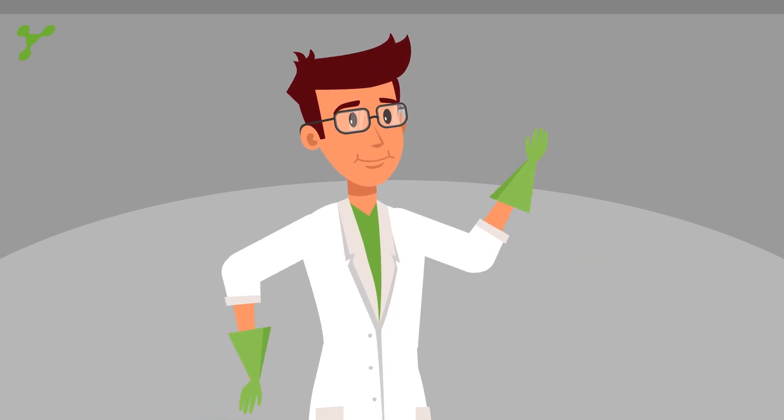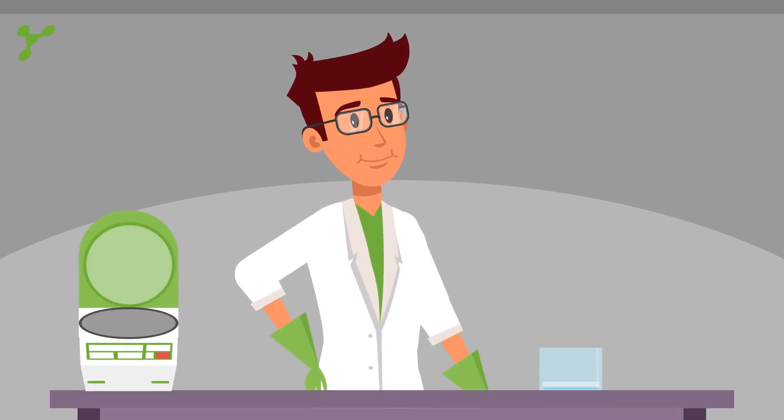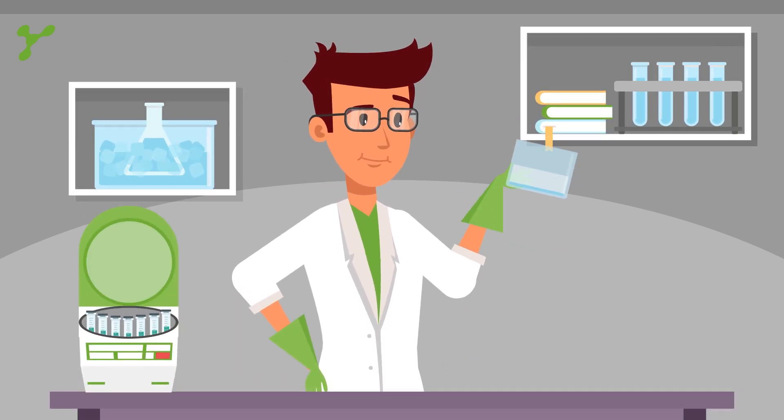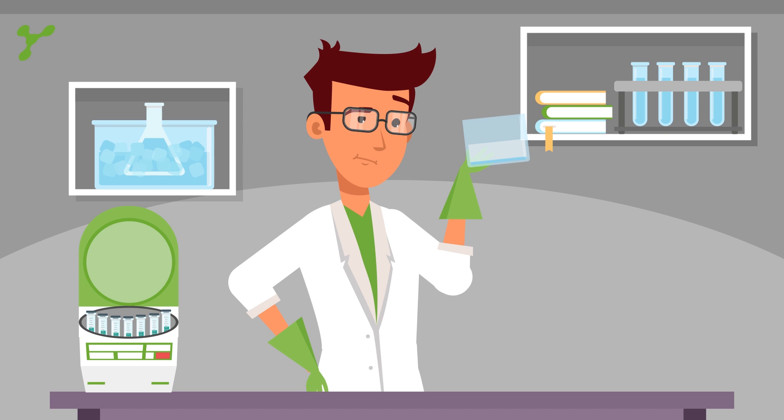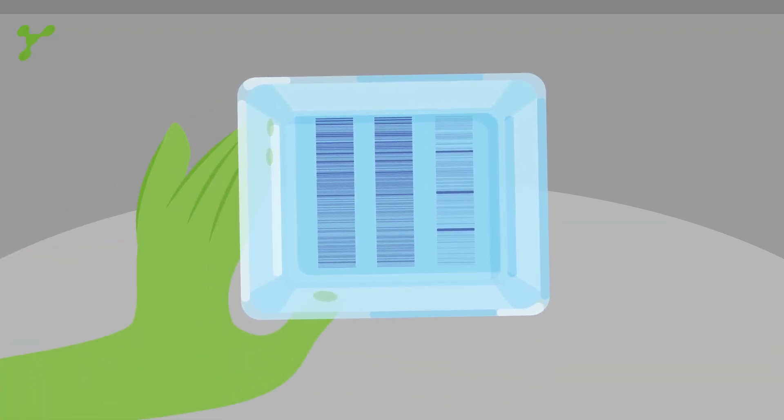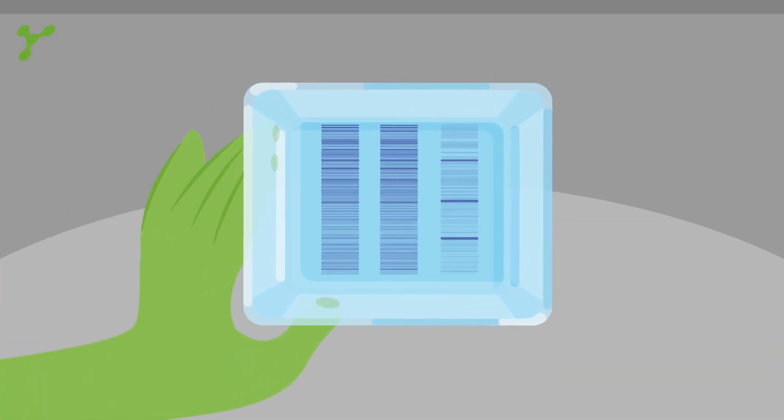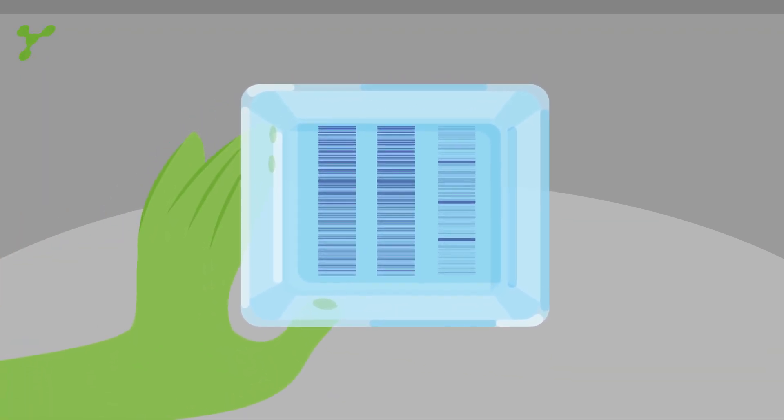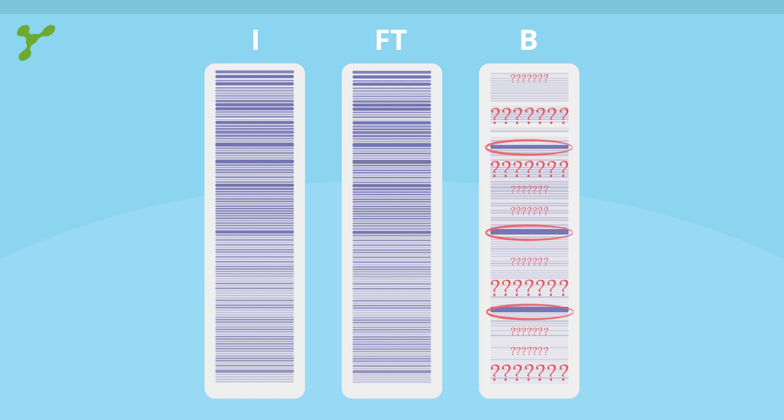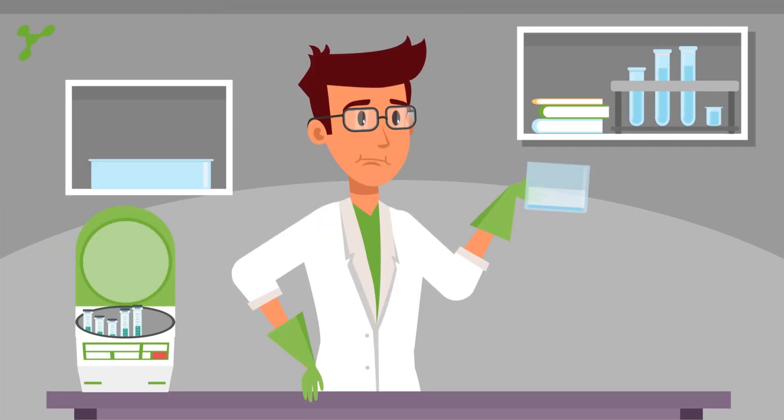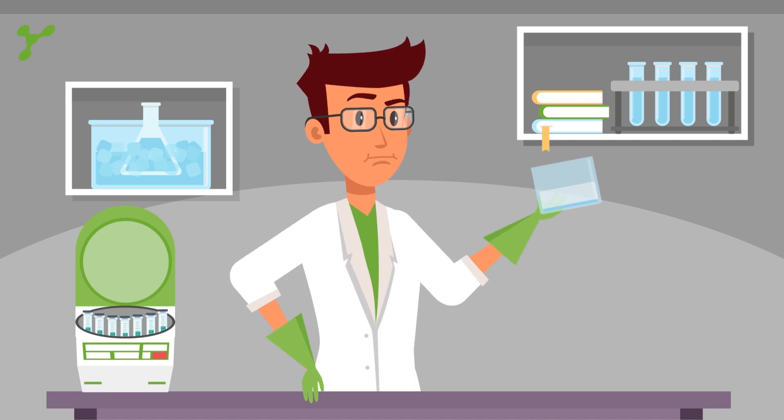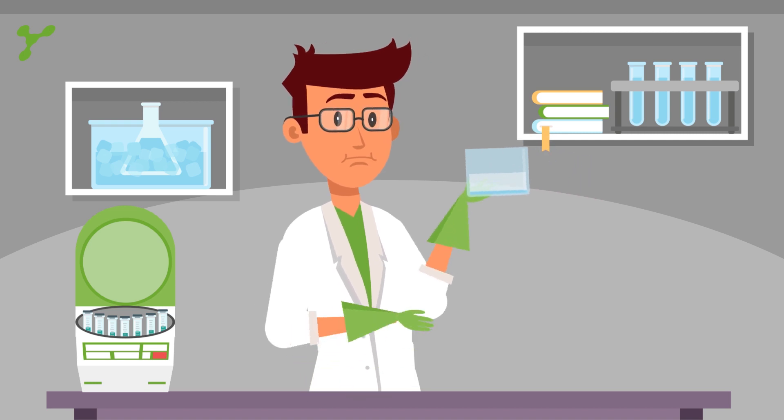This is Sam. He just completed an immunoprecipitation. It is impossible for Sam to see his protein of interest. There are multiple bands and a lot of background. How can he avoid the messy background and keep the protein of interest?